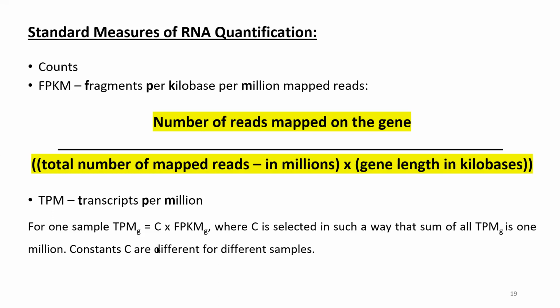Another thing, how big is the cup? That is also very important. Is it a small cup or is it a bucket-sized cup? If the gene is bigger, statistically more reads could fall onto that gene. And if the gene is short, statistically speaking, there would be fewer reads. So there are different strategies of normalizing the data as well.